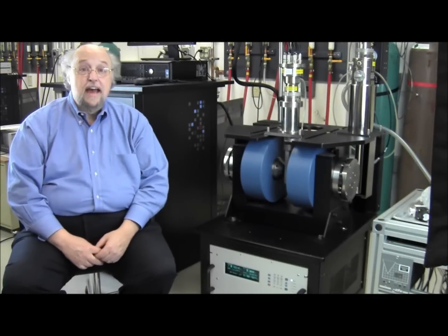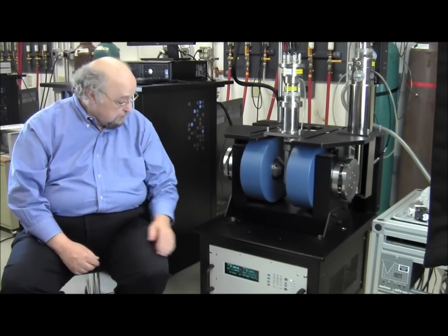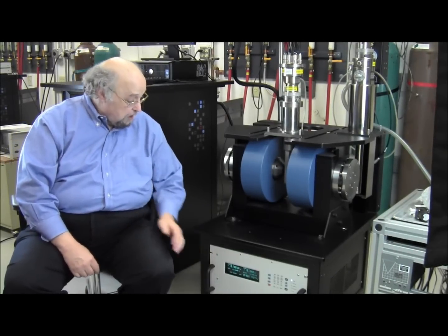So the magnet needs a power supply to generate the magnetic field, and that's what this box here is.